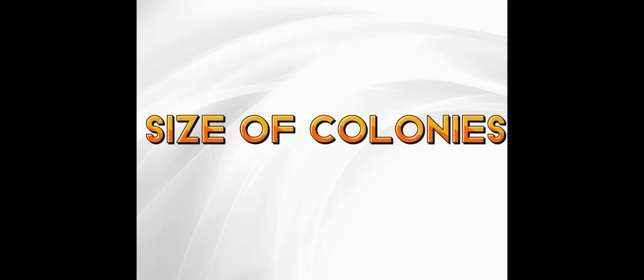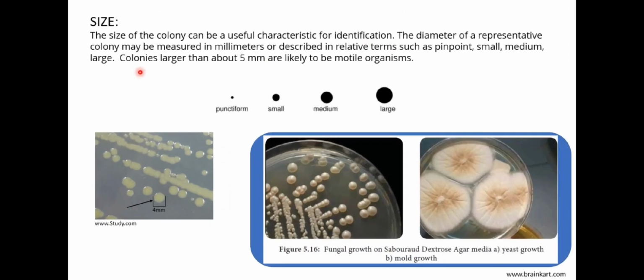Size of colonies. The size of the colony is determined by its diameter and measured in millimeters. Knowing the size of the colony can be a useful characteristic for identification. The terms to describe the size of the colony are pinpoint, small, medium, and large.